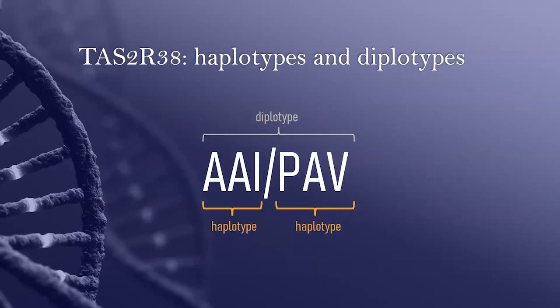So you'll notice on the previous slide, I had this letter combination. This whole string is called a diplotype, and the slash divides it into 2 haplotypes. These letters are not all nucleotide letters, so you can see they're not A, T, C, and Gs. So we aren't actually referring to the letter at the SNP spot in the DNA code, but to the resulting amino acid in the polypeptide that would be changed depending on what allele you have.